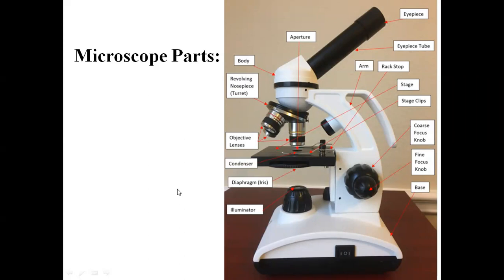Okay, so the illuminator actually has a bulb. It is your tungsten bulb, a normal bulb. Once you switch on this portion, the electricity makes this bulb glow, and after illuminating, all the light falls into this diaphragm. There is a diaphragm which is going to limit your light.